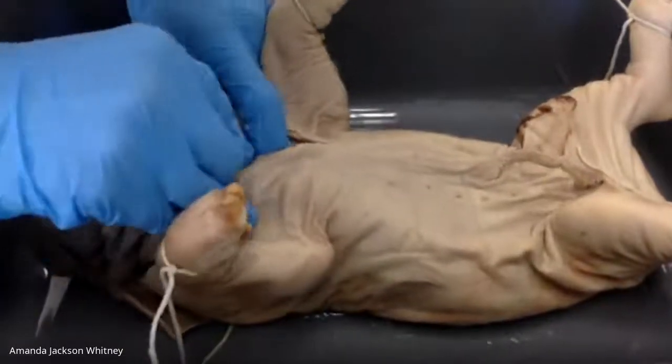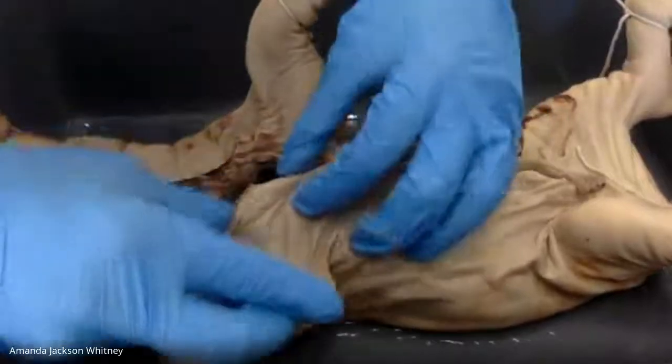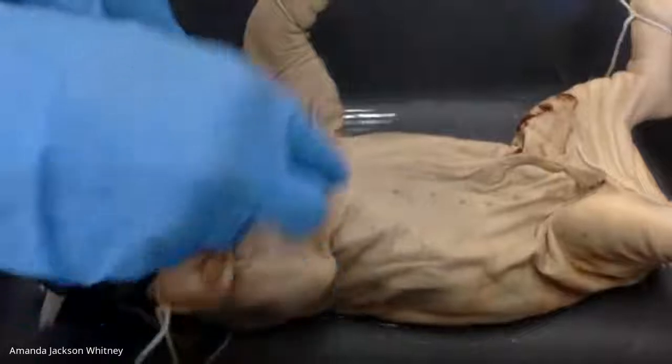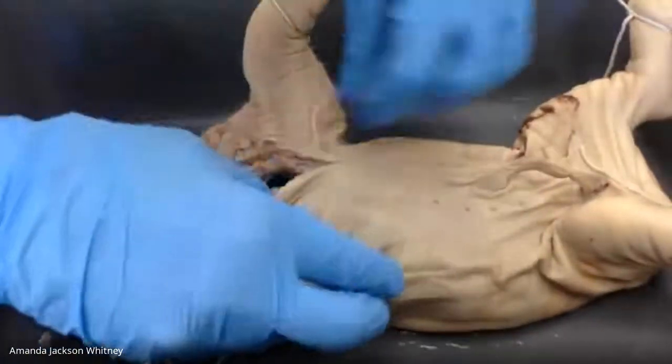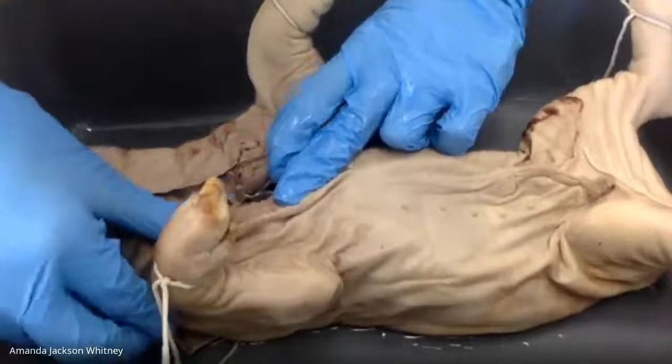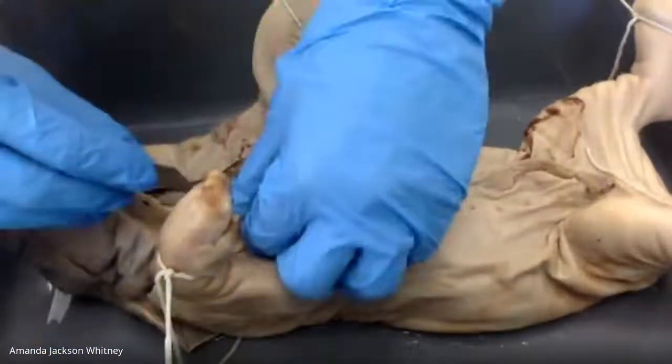Inter is like between. Costal is rib, which you'll be able to see some of the ribs here in just a little bit. Okay. I'm still trying to be a little conservative as I cut here.